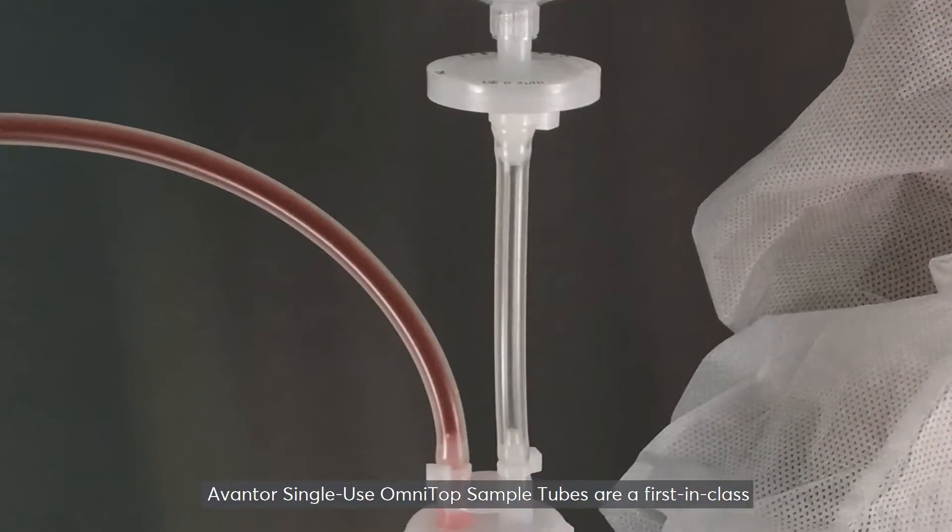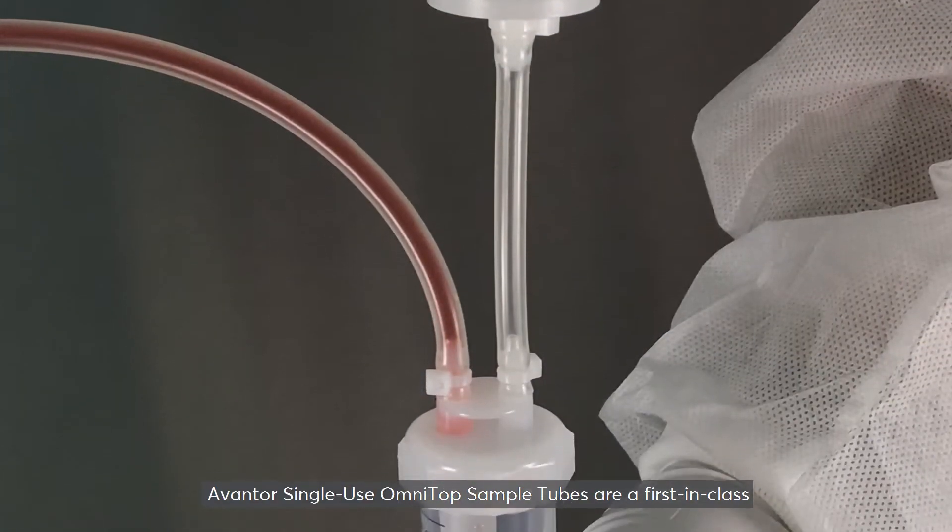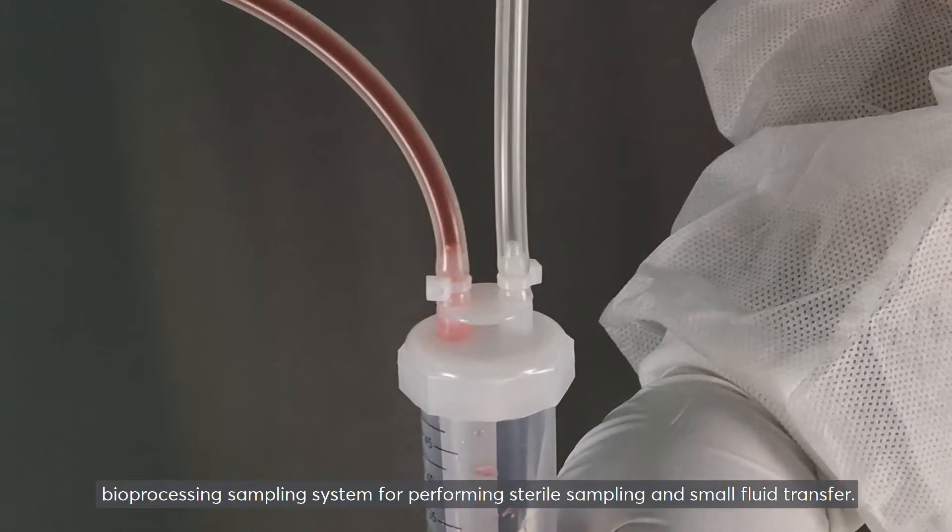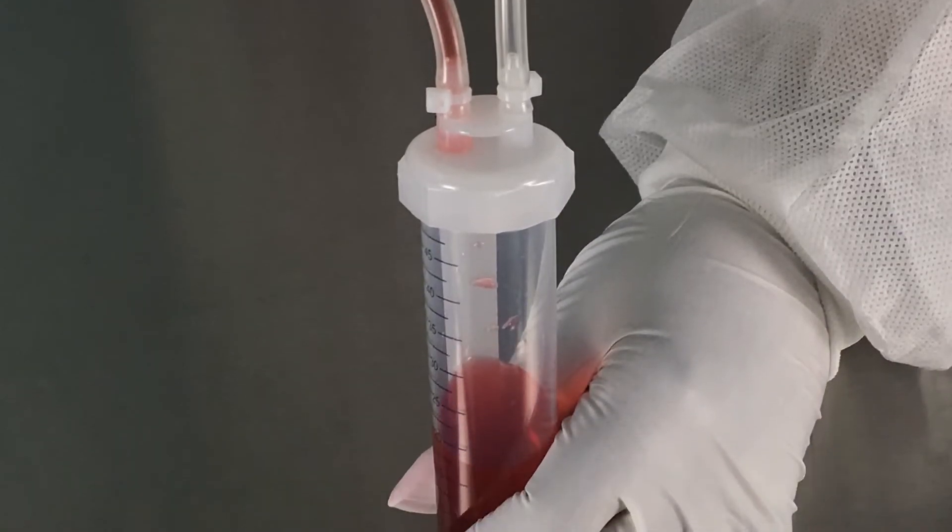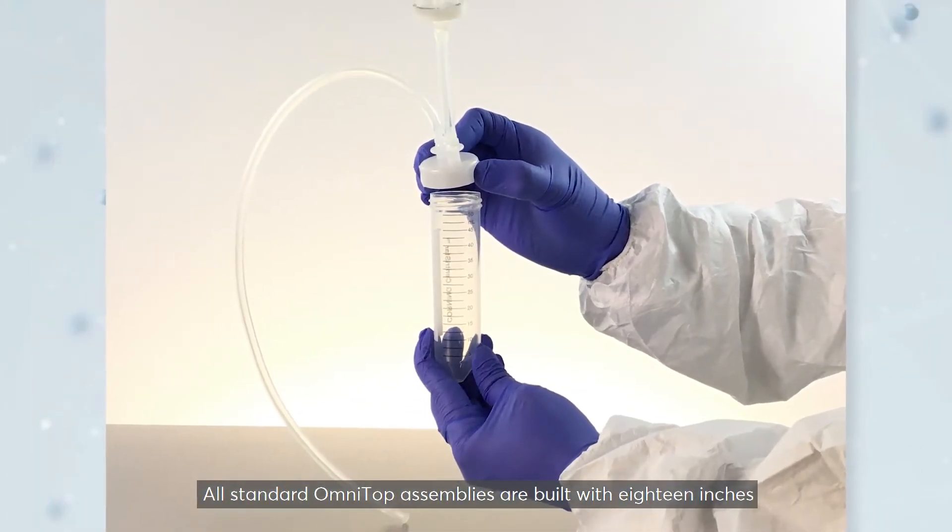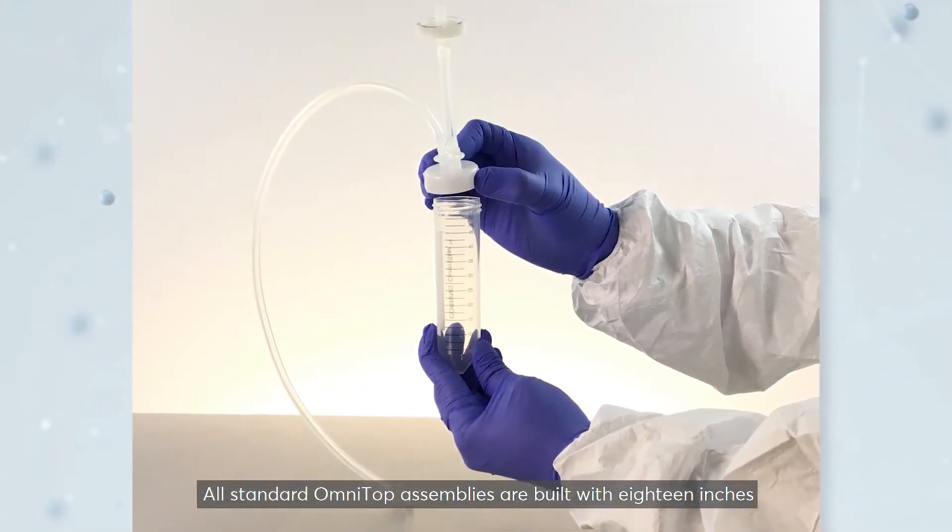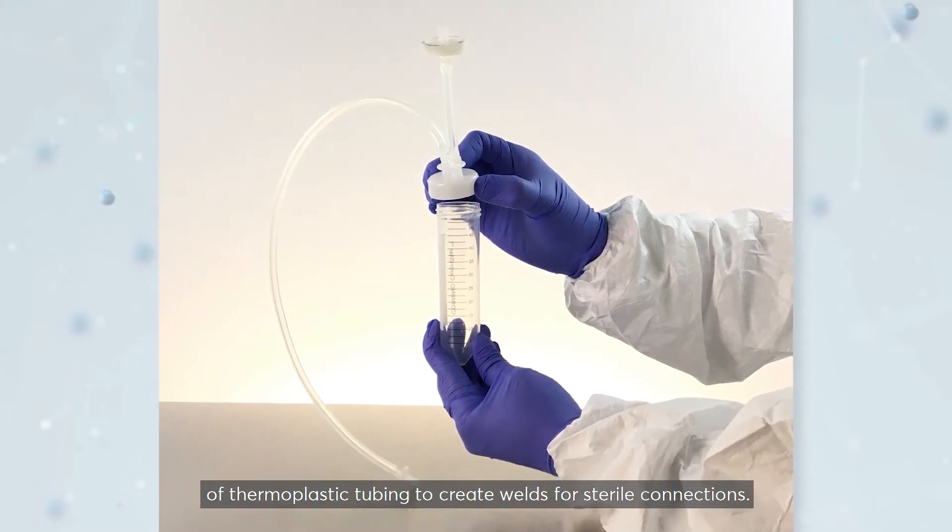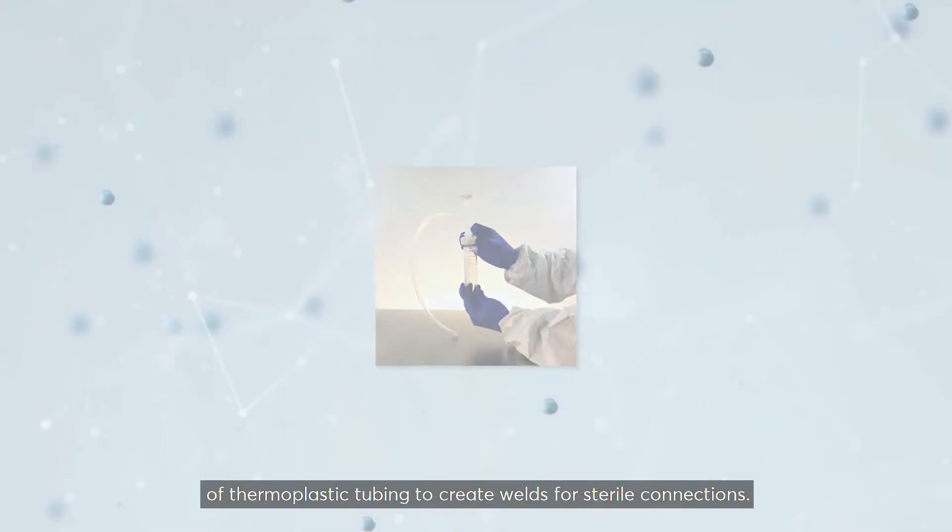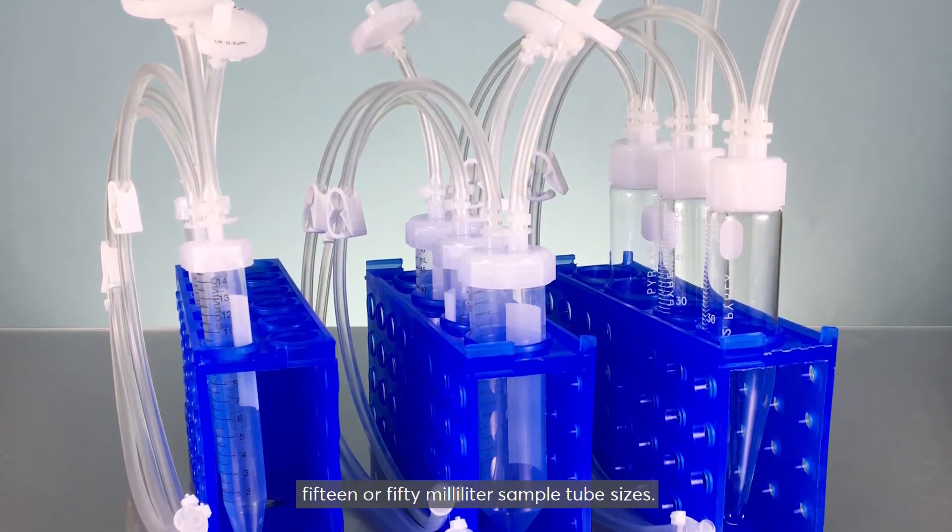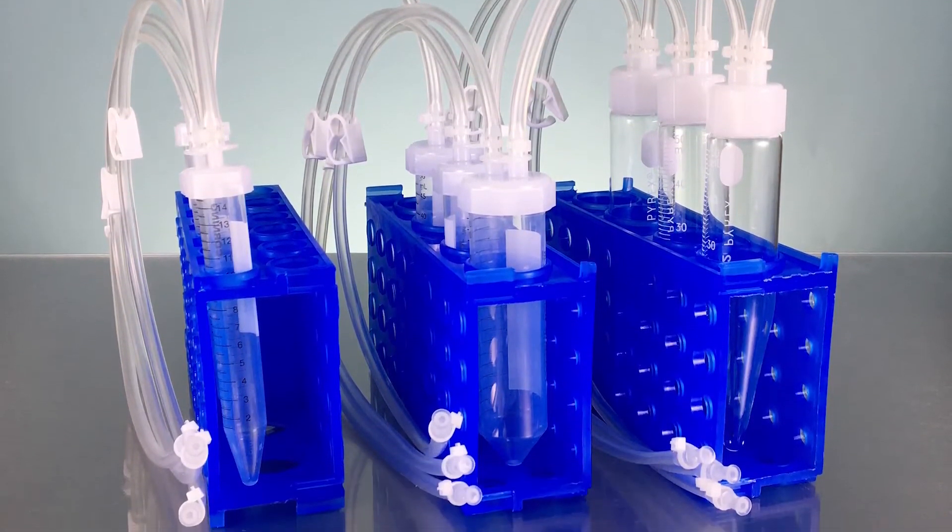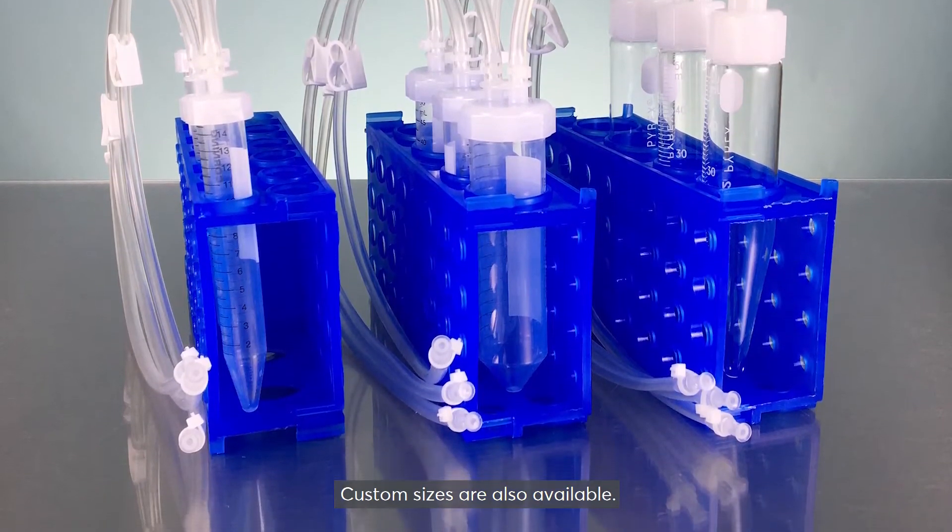Avantor single-use OmniTop sample tubes are a first-in-class bioprocessing sampling system for performing sterile sampling and small fluid transfer. All standard OmniTop assemblies are built with 18 inches of thermoplastic tubing to create welds for sterile connections. Multiple standard configurations are available in both 15 or 50 milliliter sample tube sizes. Custom sizes are also available.